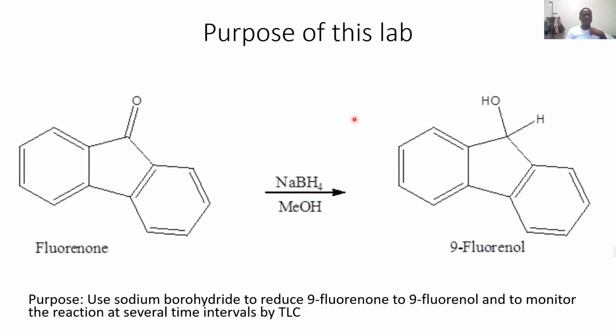And as you're doing this reaction, yes, you're learning how to do a reaction, but what's very important about this reaction is how you use the TLC, the thin layer chromatography, to monitor the progress of your reaction. Because basically, at several time points, you're going to take samples from your reaction and then you develop it to see where the reaction is at.